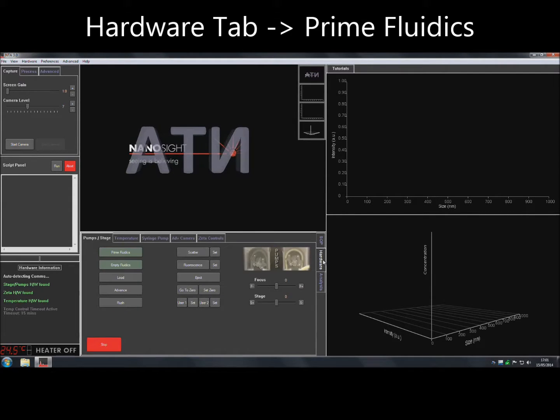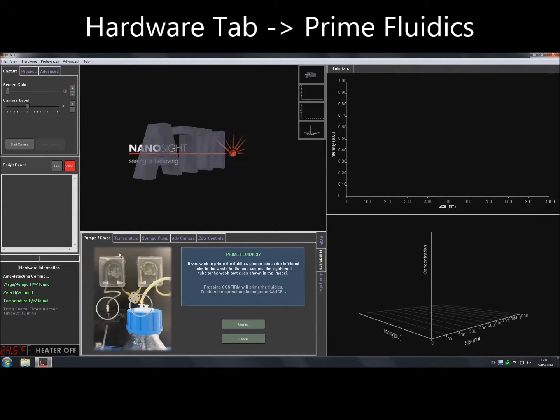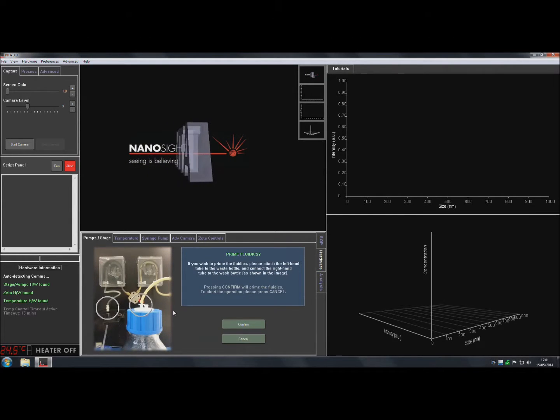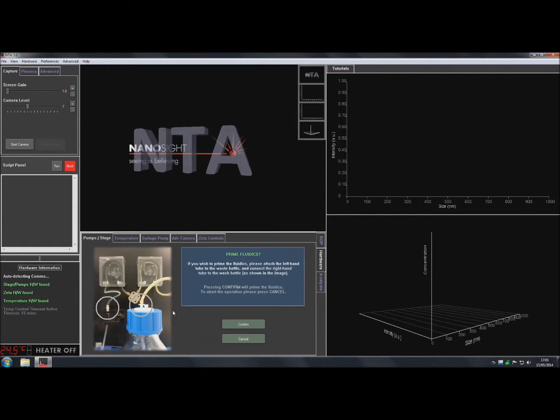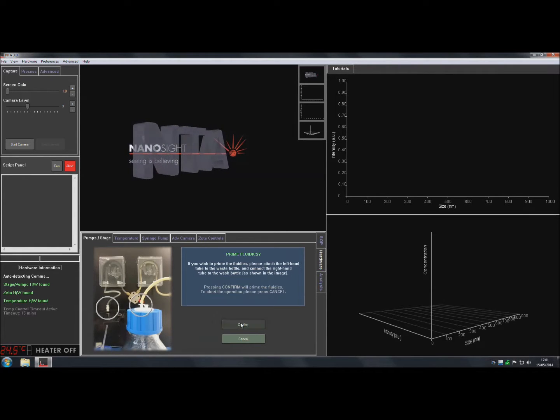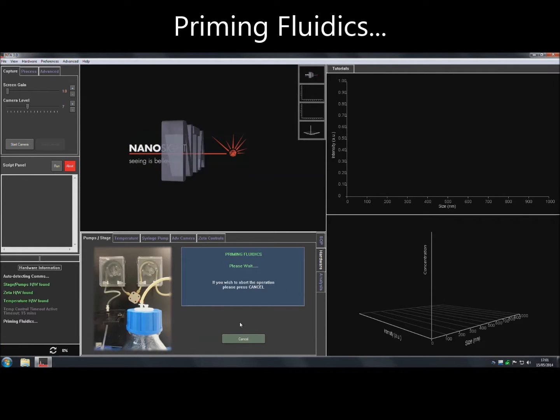Navigate to the Hardware tab at the bottom of the main screen. Select the Pump Stage tab and click on Prime Fluidics. The image shows how the tubing should be connected prior to clicking OK. Prime Fluidics is used to fill the tubing at a slow speed to ensure that pressure buildup inside the gasket is kept to a minimum.